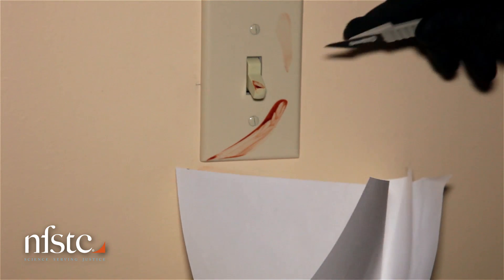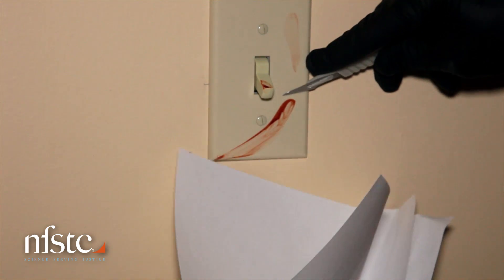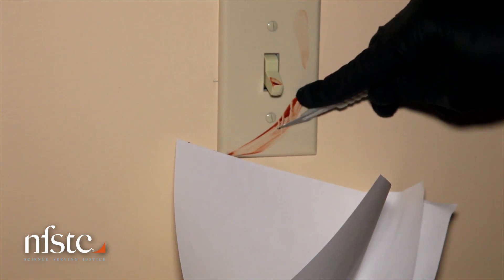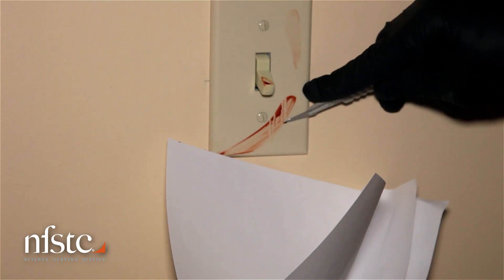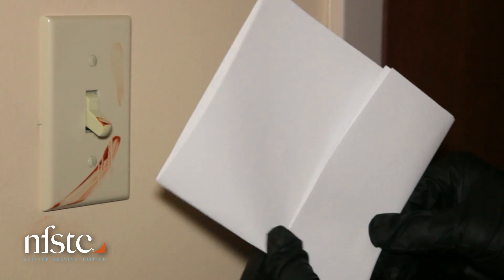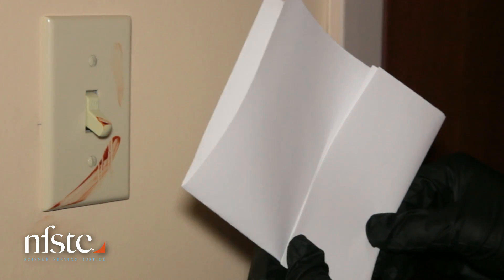Using a clean razor blade or scalpel, gently scrape an evidence sample into the pocket. Once collected, carefully fold the paper pocket closed so that the evidence is securely held inside the bindle.